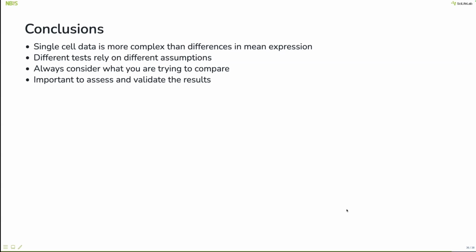But then, when you interpret the data, you can see, does this make sense? And then you can interpret a bit more. And again, as I said, it's always predictions. Even if things are statistically significant or not, you still need to consider, does it make sense, and is this something I can go forward with? But yeah, it's hard to correct for it completely.